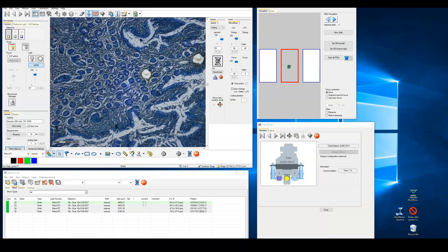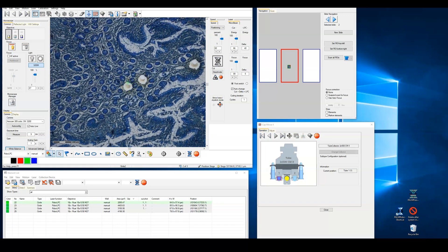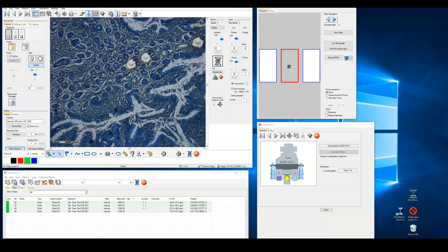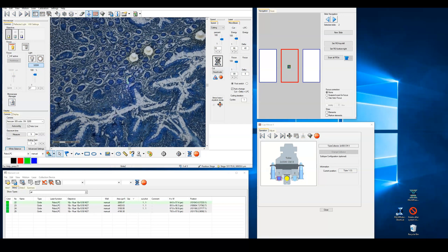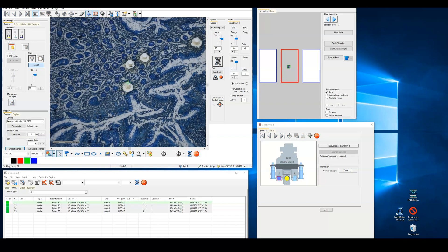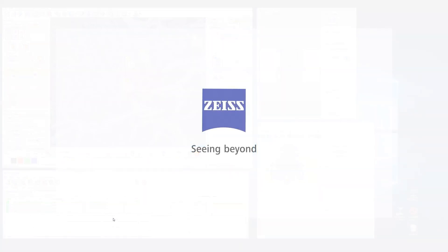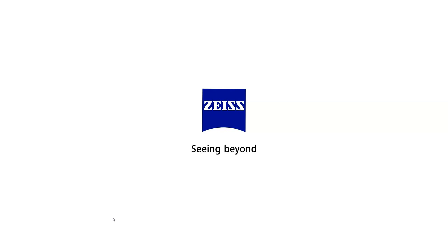Alternative forms of cutting, such as joint cut or Robo-Center LPC, are derivatives of this Robo-LPC function that I encourage you to explore. With that, we've completed an introduction to the use of the Palm Laser Capture Microdissection System. Please look for the accessory documents regarding sample preparation and future tutorials dealing with the use of fluorescence in combination with laser capture.